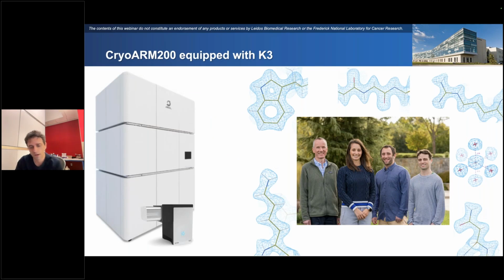So when Shriram made the switch to start his biotech company in Vancouver, before he fully moved up there full time, there was a transition period where he was still advising the NCI on equipment and that kind of thing. So when we were making the switch up here to the Frederick National Lab, Shriram made the decision for NCI, when they were purchasing a microscope for the operation here, to go in a completely different direction, both as far as acceleration voltage and also vendor.